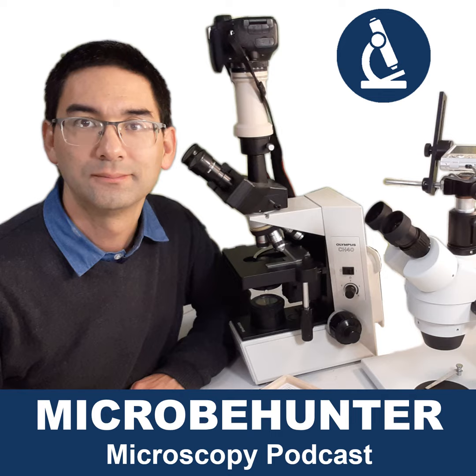The second thing that some folks like to do, I'm not so much into that. Some folks like to collect microscopes, especially antique microscopes. They're very nice, brass ones. They look very artistic. And some folks also like to collect more modern microscopes. So that is microscope collecting, indeed one aspect of amateur microscopy.